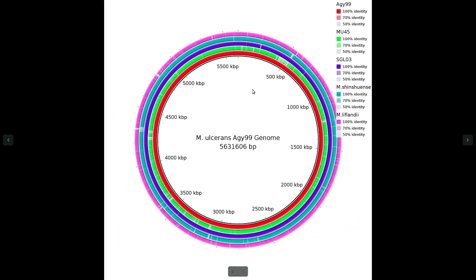So if you look at the image here, it was JPG. Now there's the title I gave it, and then there's the genome size that was specified. Okay, and these are the labels that I was using, referring to the genomes. Now if you look at this particular ring structure here, you realize there are some gaps at certain places. These gaps indicate that those particular regions, the sequences there, when compared to the reference genome, are not the same. Remember, we talked about the 50% identity threshold.